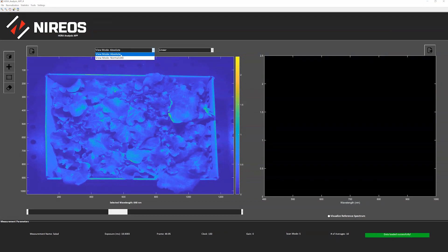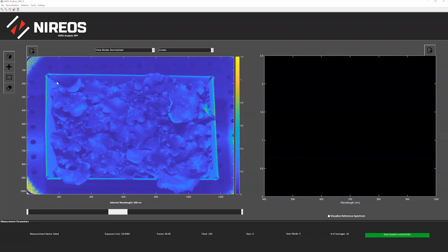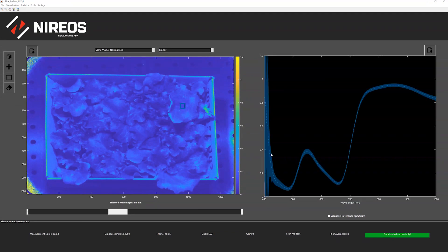We can plot the image in the absolute, this is what we were doing before, and normalized. So this is the normalized image, which is actually a reflectance one.